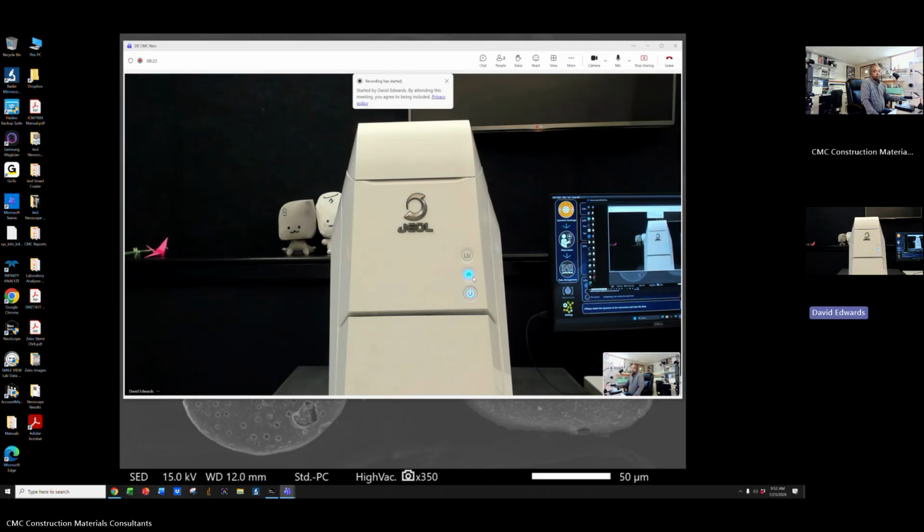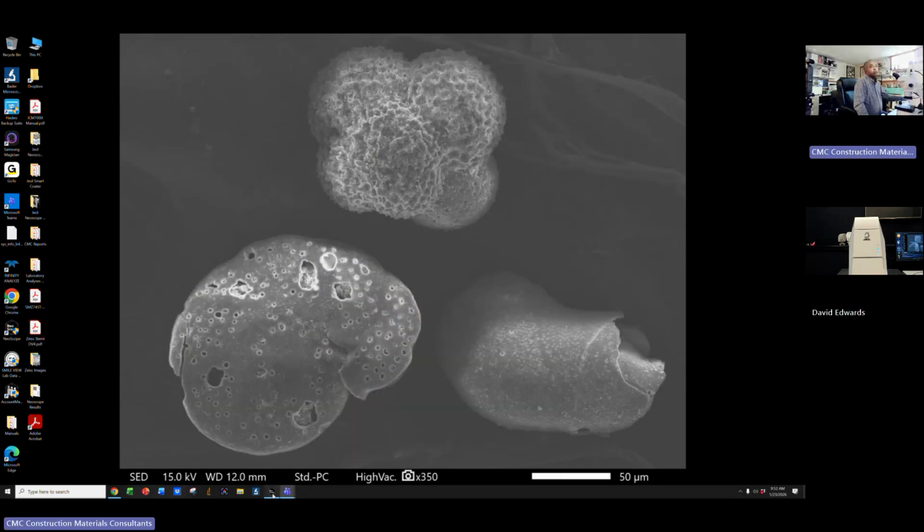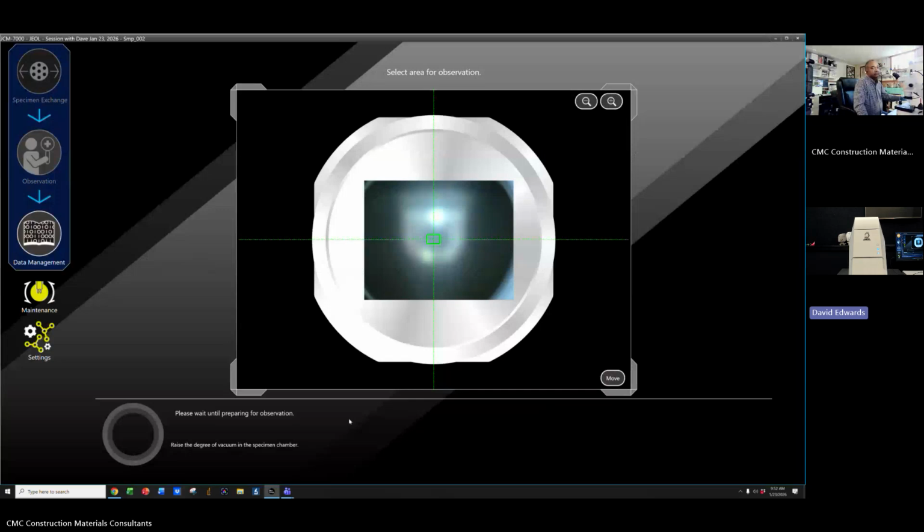Yeah, if you can show me your screen again. Right now I'm seeing mine. Yep, okay. There we go. No, so it didn't take the image. Right? So it's not that it's blurry, it's not taking a new image.